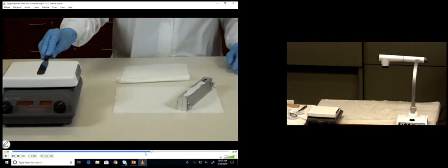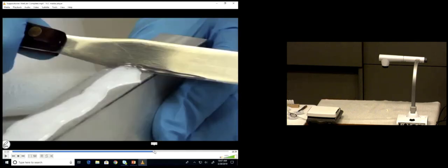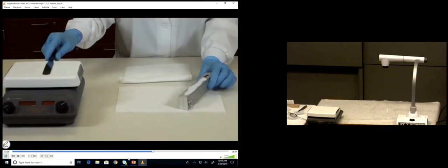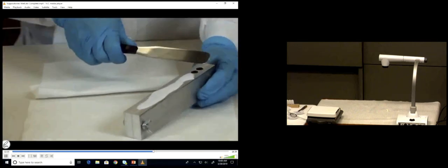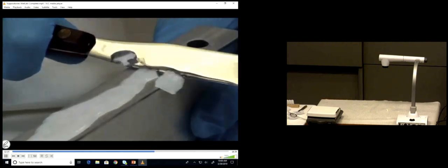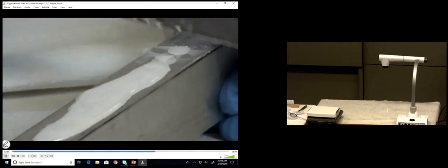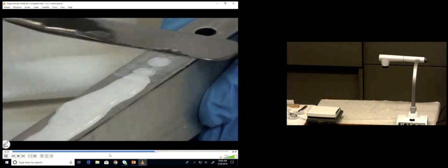And then I just want to make sure you watch. This is a little bit tricky. Let me back up just a little bit here. Go ahead and use it. It's a sawing motion, a little bit back and forth as you're pushing. It does take force to push it off, but it's a little bit back and forth, and you can see the heat from the spatula is starting to melt that. While you're trimming, it's melting some of that base and filling any of the divots.